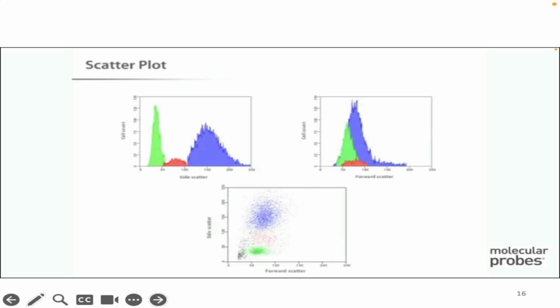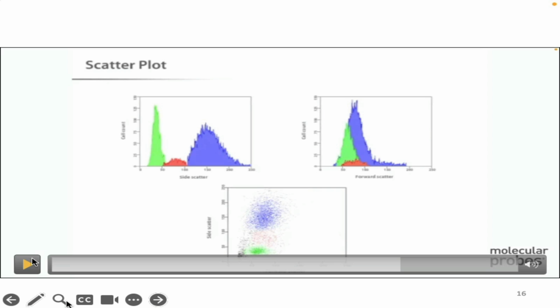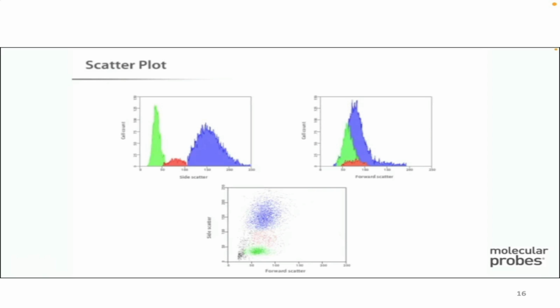So they have really small stuff. They've got some small stuff that's not super granular. They've got some bigger stuff that's more granular. And it's only a little bit bigger. You can look at things in a lot of different ways like this. And each one of the dots on that plot is a single cell that we're able to get data on.